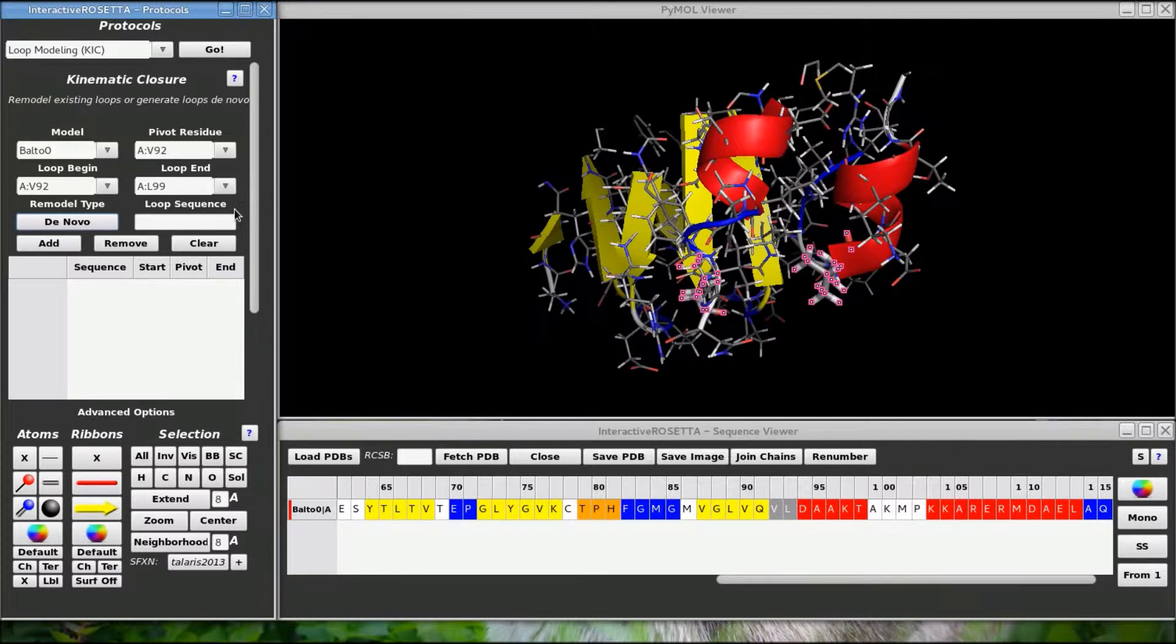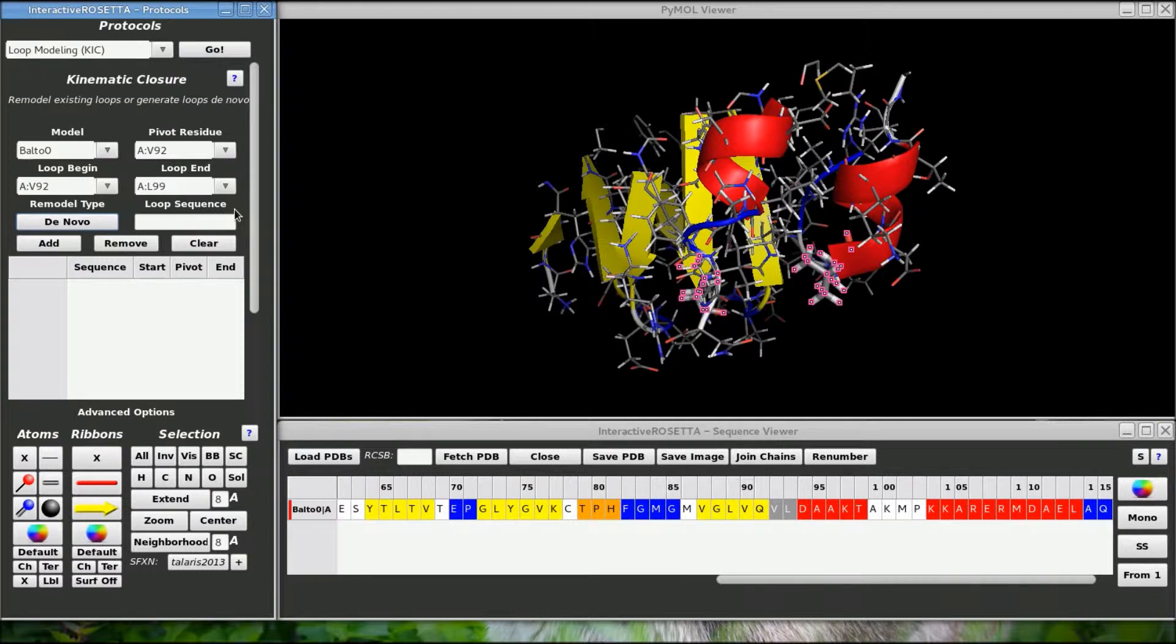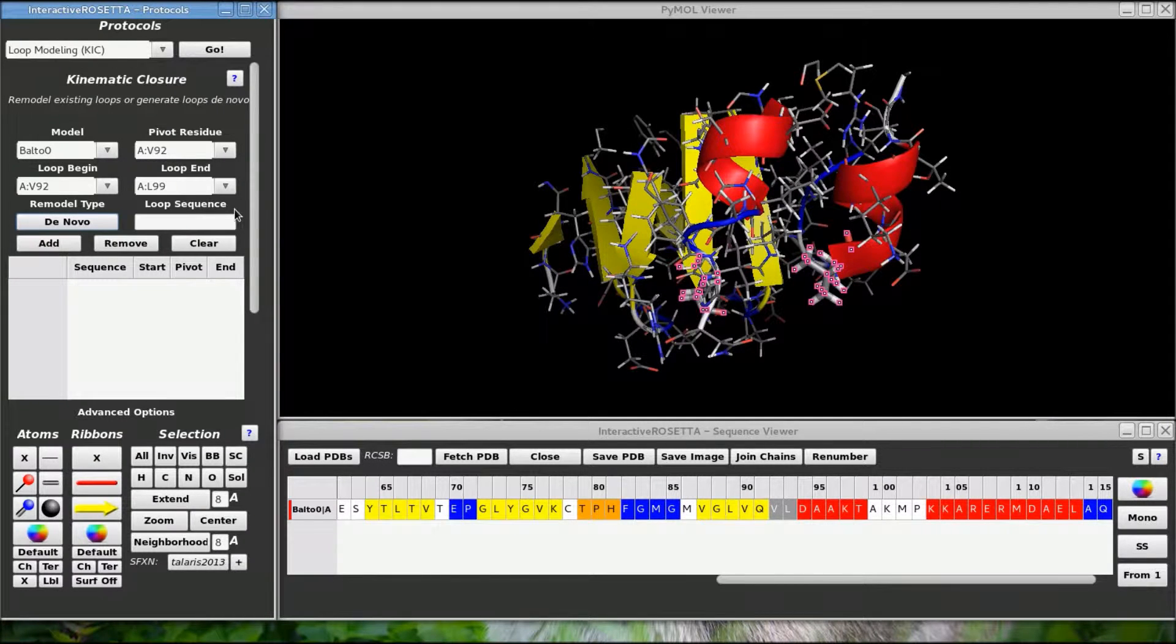I should point out that for new loops, the beginning and ending residues are the anchor points, so these residues will not be mutated. The new sequence will appear in between the two of them.